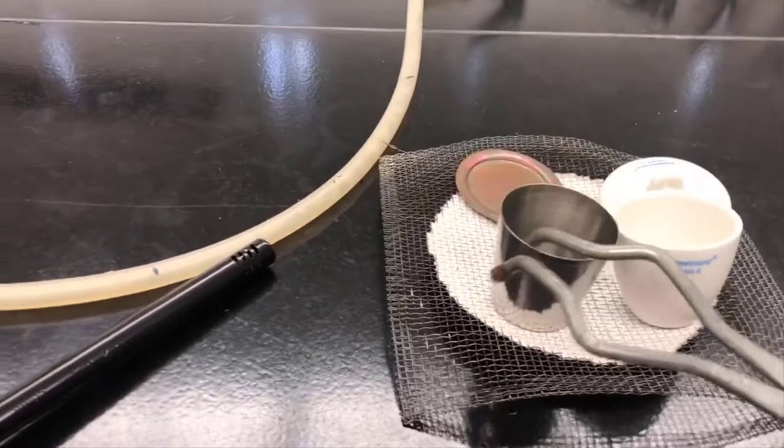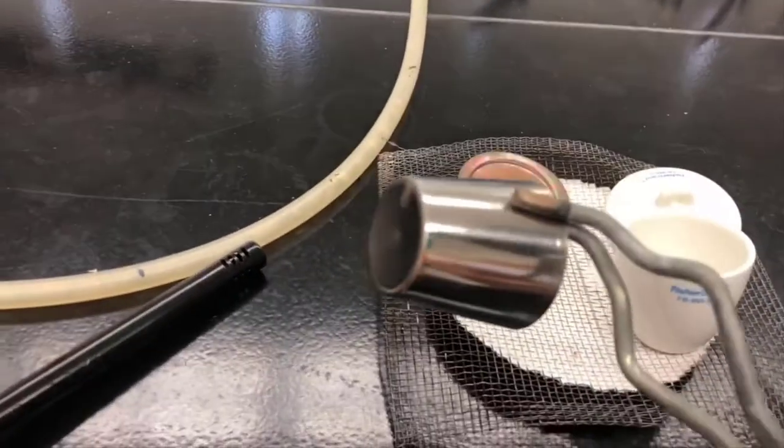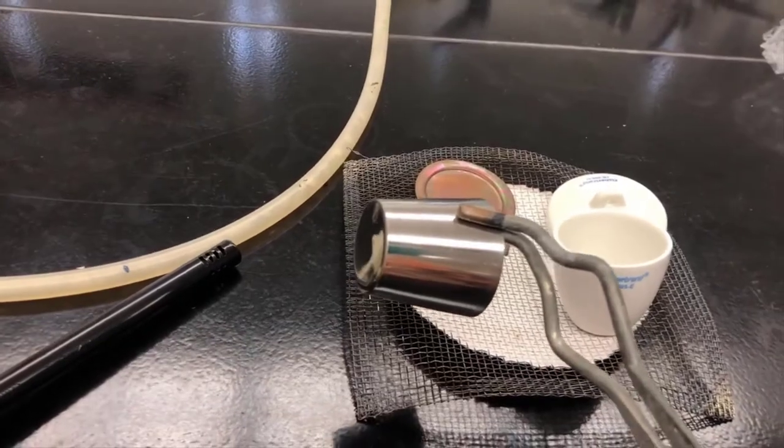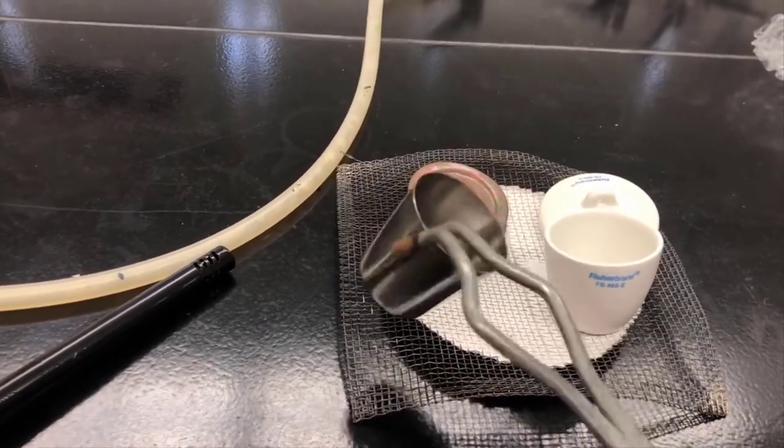A steel or stainless steel crucible, unfortunately when you heat them, often oxidize quite a bit, and then the result is you gain mass just from heating it.